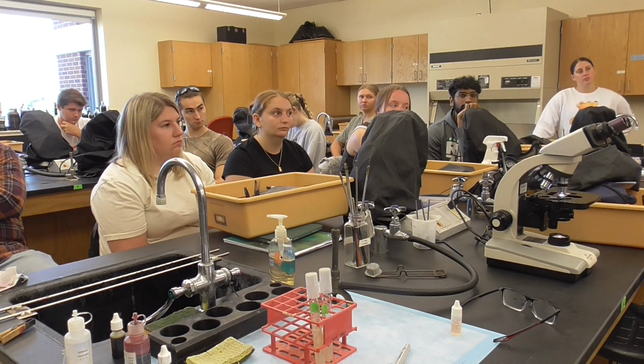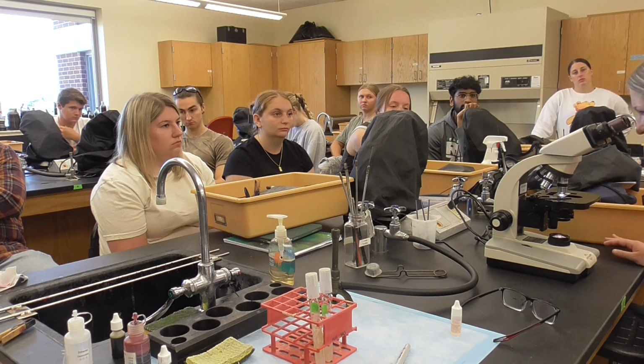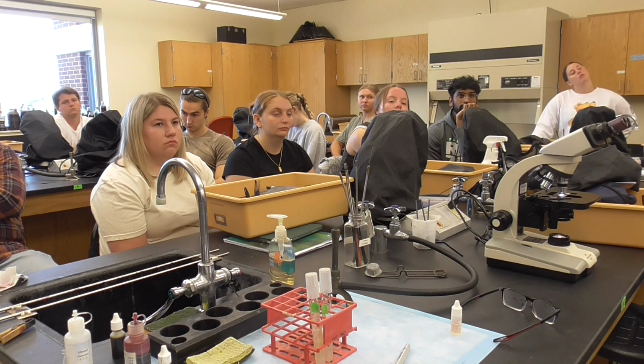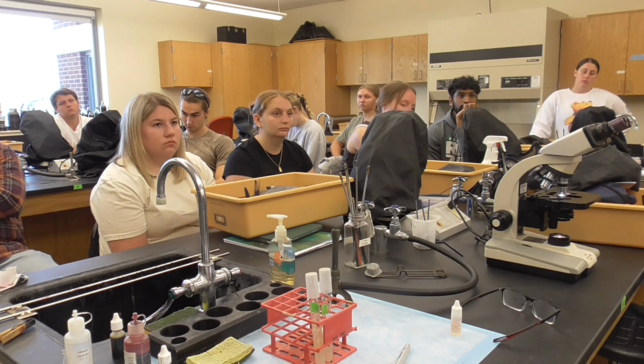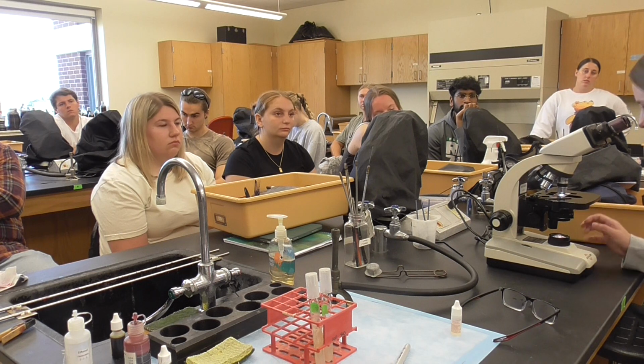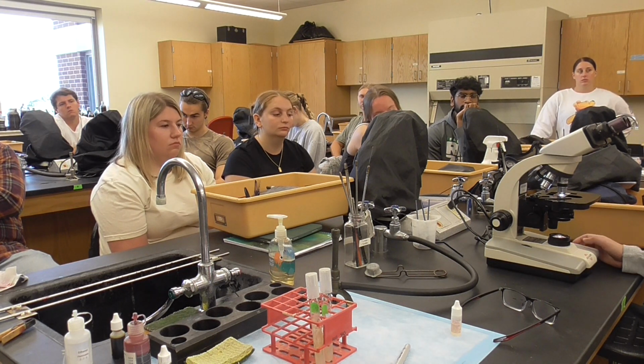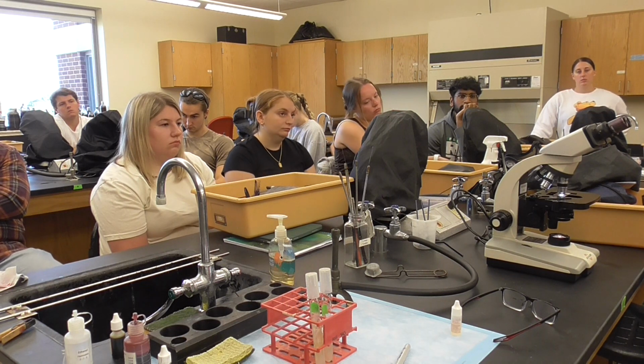Can you see it? That's what we want you guys to do, to report it. So ideally it's gram-negative bacteria for E. coli, but your results may look a little bit different. That's what you should record. It could be the slant got contaminated. Now let's go ahead and see the lactobacillus, what it looks like.